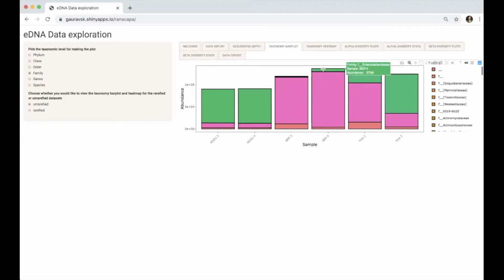We do see some Enterobacteriaceae in this black-eyed pea sample, but less in this one, much less in this one. You can barely even see it. It just looks like a big black bar because there are other bacterial types all clustered really closely together, so you can't really differentiate their colors. But you see this sample has about 900 sequences versus this sample that has about 6,000.